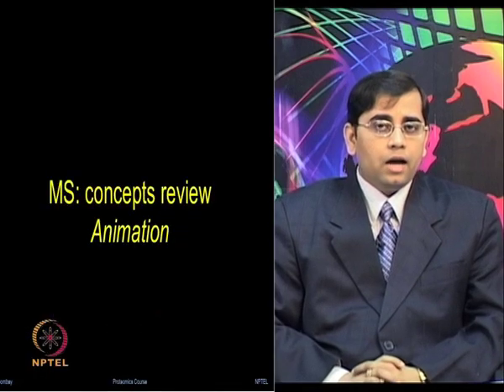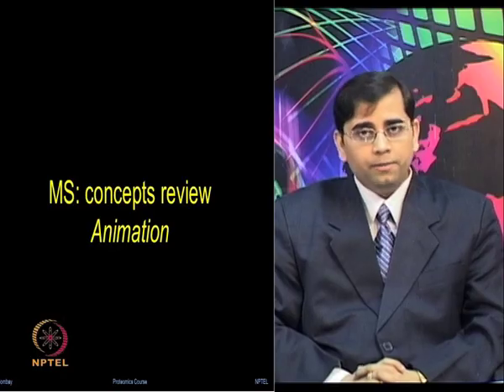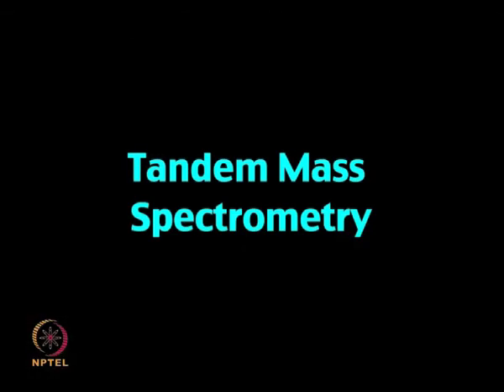Some of the important concepts involved in ionization, mass analyzers and tandem MS, I will describe in the following animation. Tandem mass spectrometry.